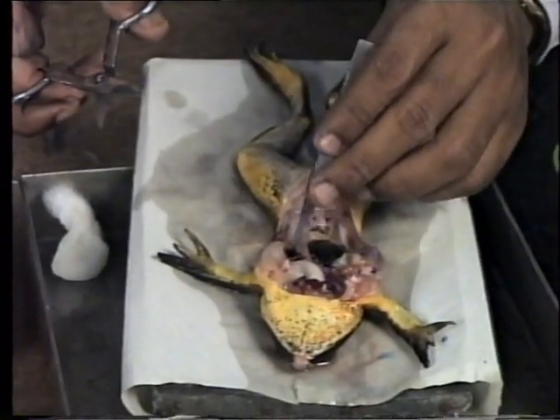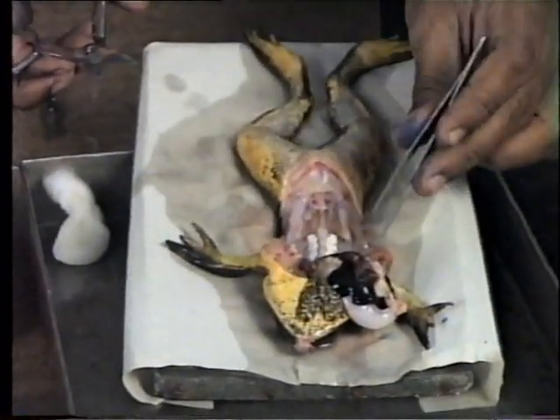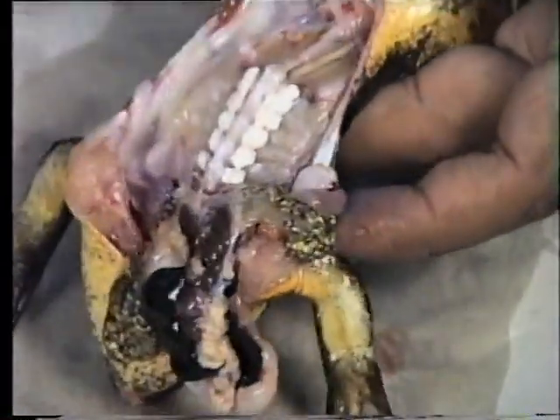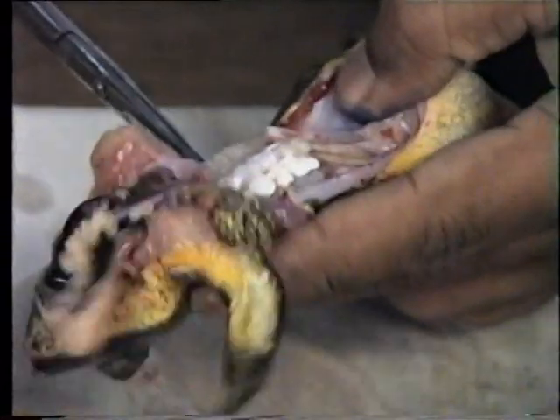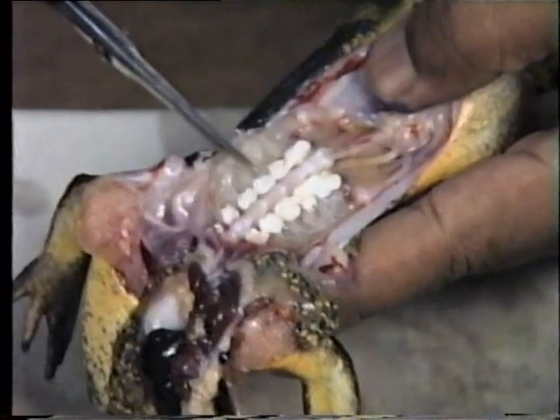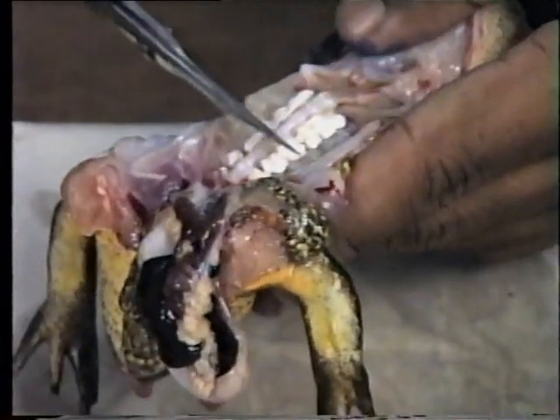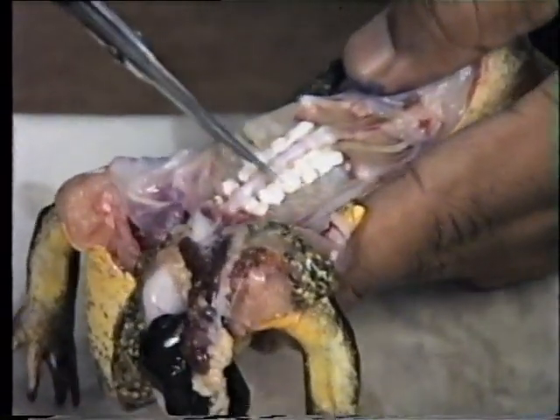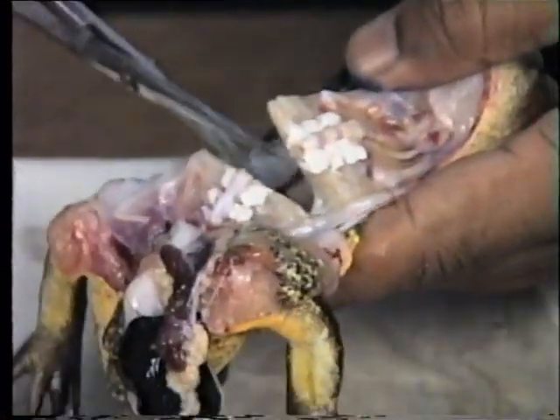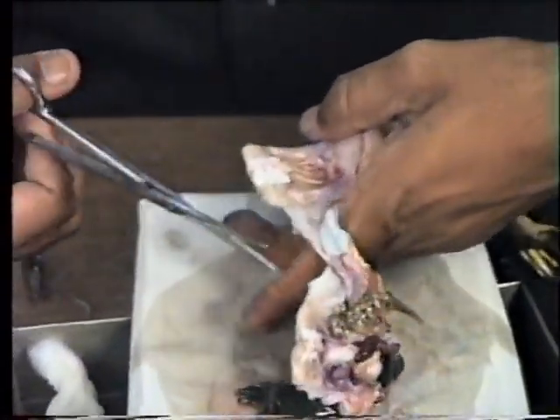This experiment is to show the effect of stimulus on muscle-nerve preparation. The gastrocnemius muscle along with the sciatic nerve is generally used for experiments related to skeletal muscle. Lay the pithed frog on its back on the dissection board, remove all the organs, cut the spinal cord in the middle, and remove the dorsal portion.